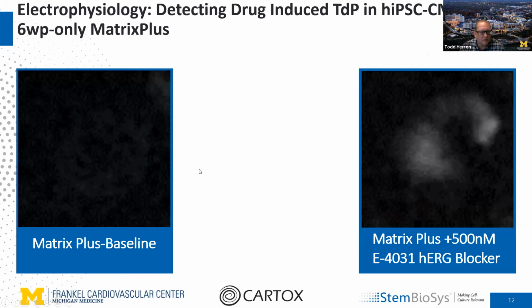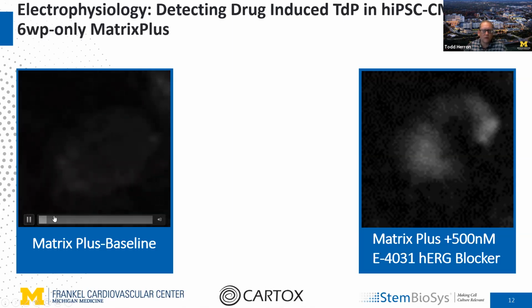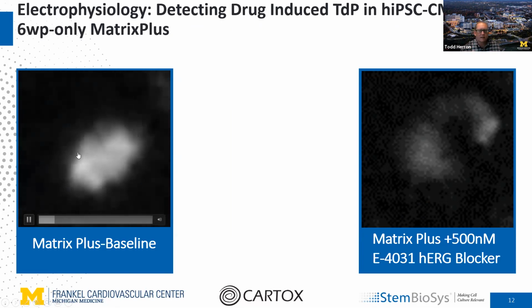So next we went on to do some electrophysiological analysis using cardiac optical mapping to detect drug-induced arrhythmias in vitro. The movie that you'll see here on the left of your screen is the baseline recording of action potential propagation through a monolayer. This is a large monolayer, about 1 centimeter in diameter.